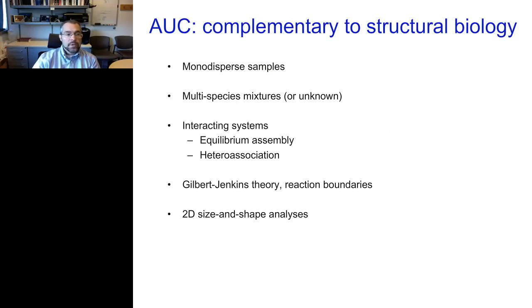All right, now we'll get to what I really wanted to talk about, which is how is AUC complementary to structural biology? My other hat is that I'm an X-ray crystallographer. We do a lot of other biophysical techniques, as Chad mentioned in the intro. And so we have found that AUC is an enormously beneficial tool for the structural biologist. And so I'm going to really kind of hit on a number of points.